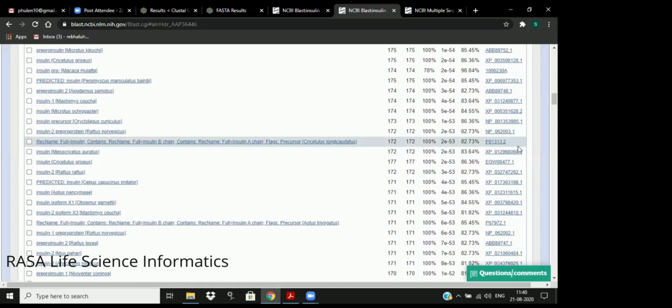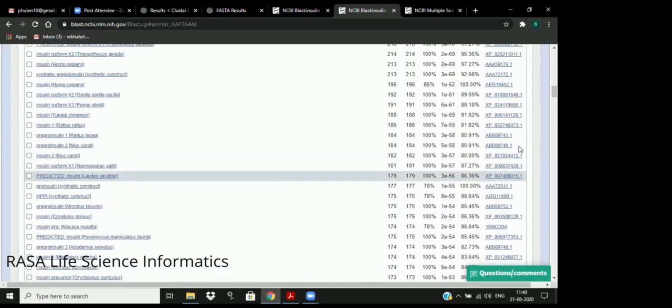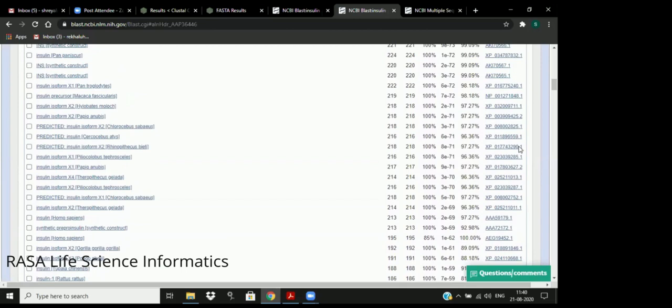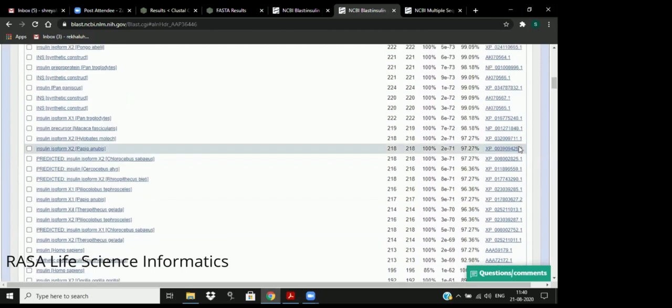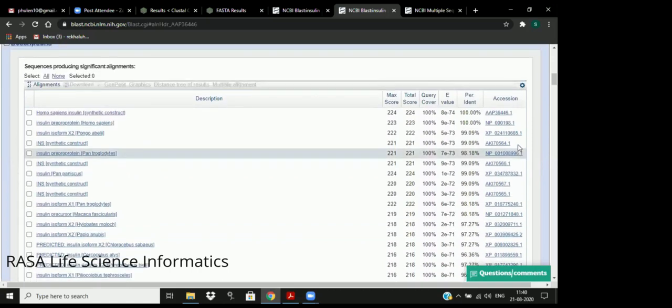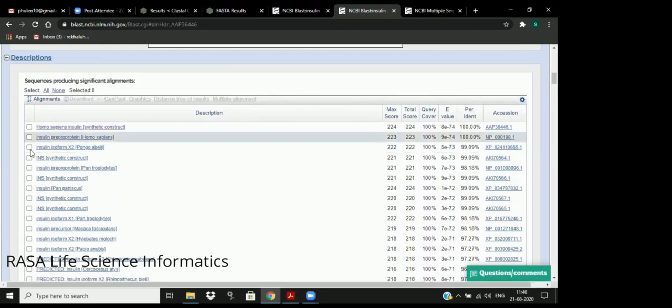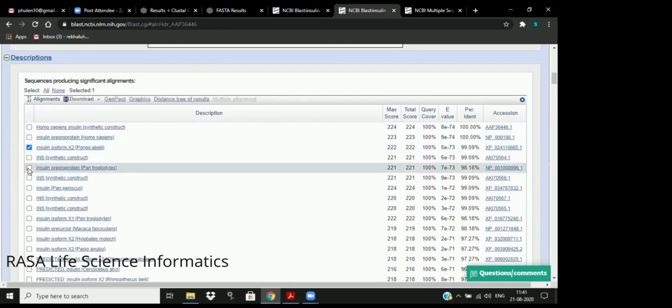Okay, now this is what your alignment is. If I give you a query and say, give me 5 homologous sequences for human insulin, except for Homo sapiens, what will you do and which ones will you pick? Yes, guys, 5 homologous sequences for Homo sapiens insulin.